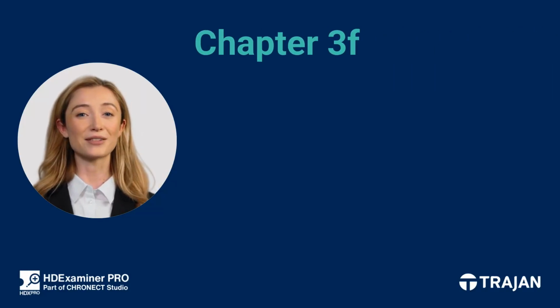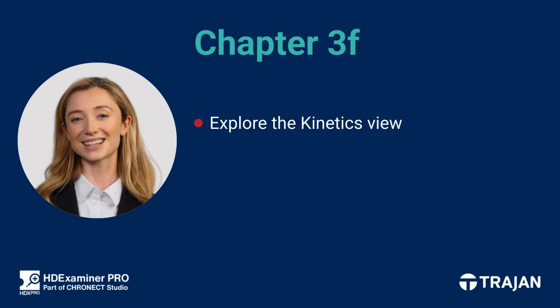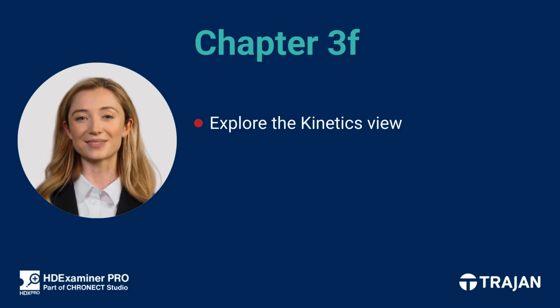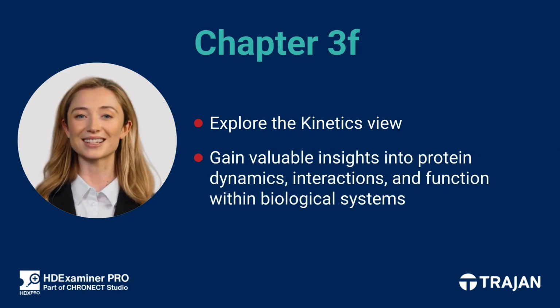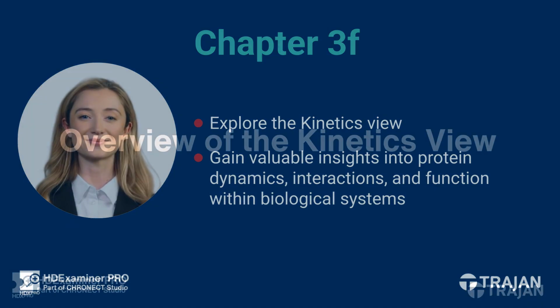Welcome to Chapter 3F. In this segment, we'll explore the kinetics view, an important tool in HDX analysis that examines the rate of hydrogen-deuterium exchange in proteins. By tracking these kinetic changes over time, you gain valuable insights into protein dynamics, interactions, and function within biological systems. Let's dive in.